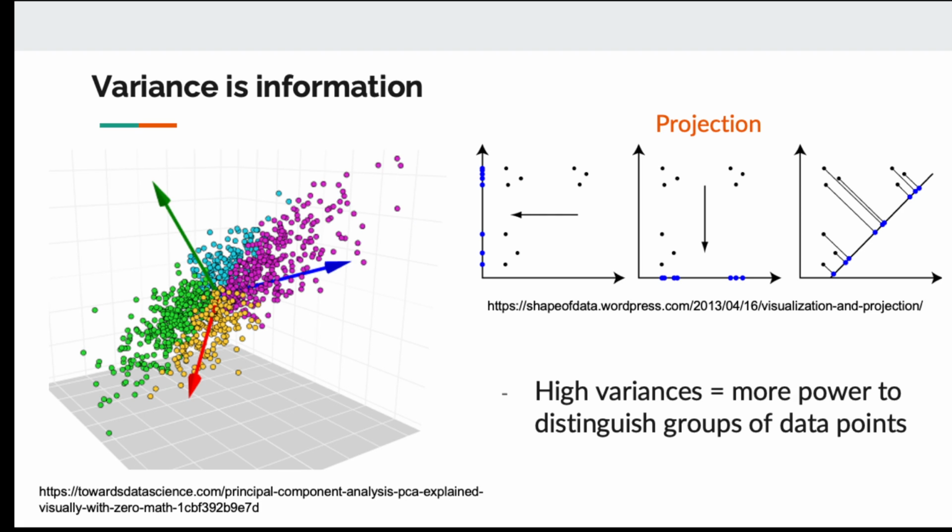When we want to visualize these cells, like 9 cells, onto the screen, we have to reduce the dimension to maybe just the y-axis or just the x-axis, or maybe with some diagonal line. The idea behind PCA is if you compare these three types of projection, like we want to reduce from two dimensions x and y to just one number. So we have a choice.